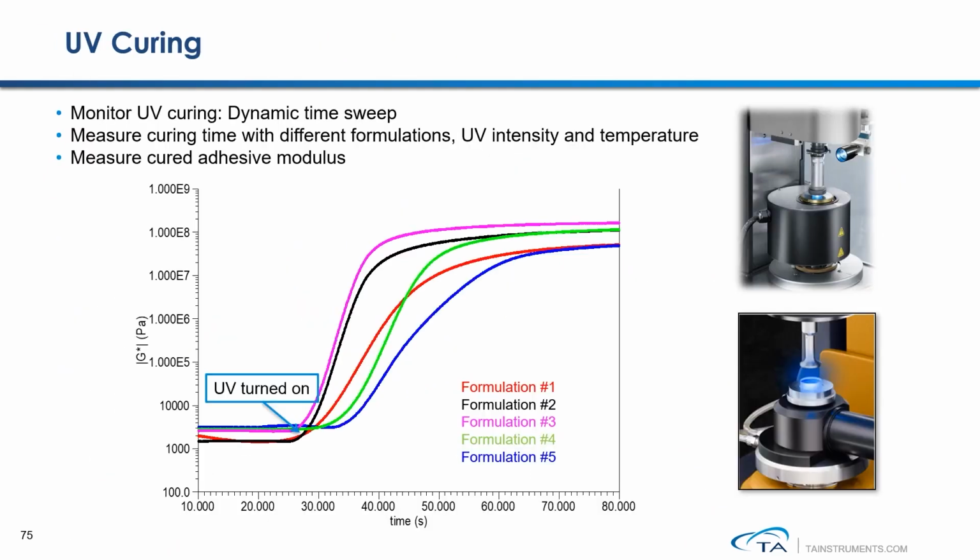In a rheological analysis, not only can we study curing with a changing temperature or time, we can also study curing under a certain circumstance. This slide demonstrates using a rheometer to monitor curing initiated by UV light. These are 5 dental materials with different formulations. Using rheological measurements, we can quantitatively compare which formulation cures faster, how fast, and also which formulation will eventually reach an ideal mechanical strength.